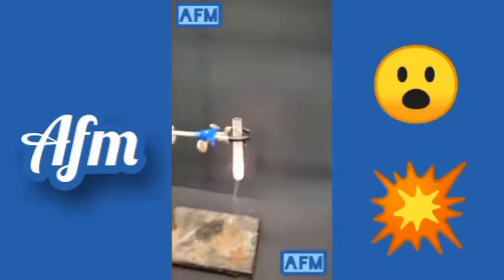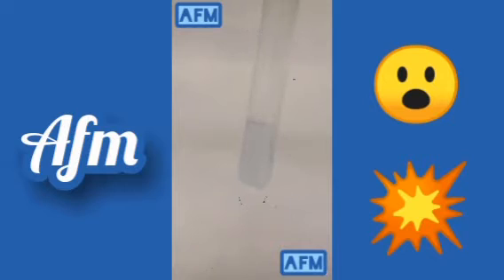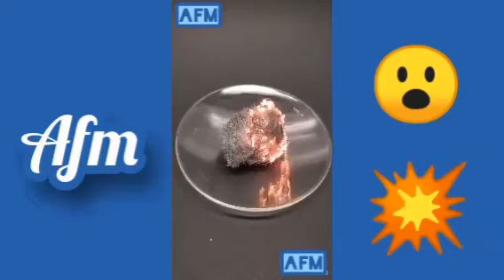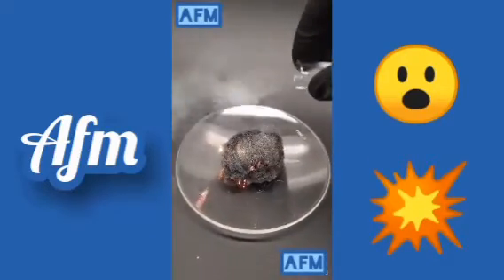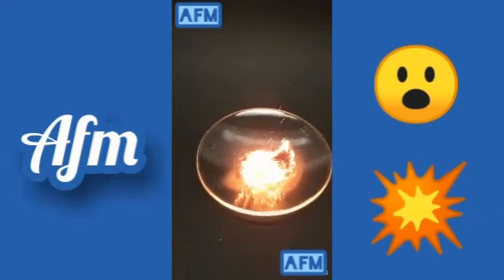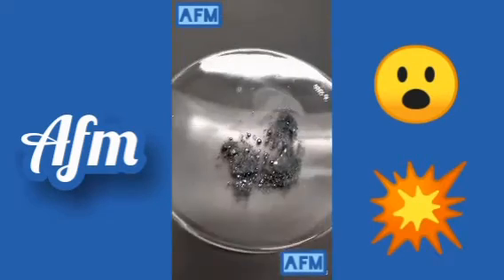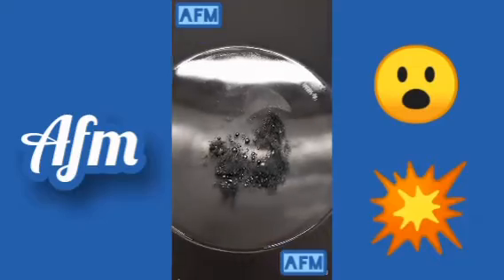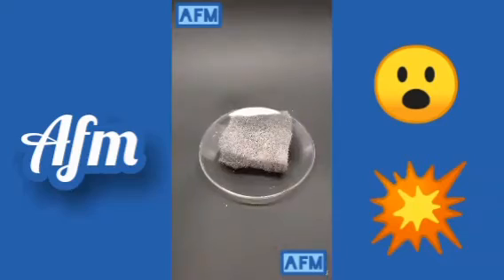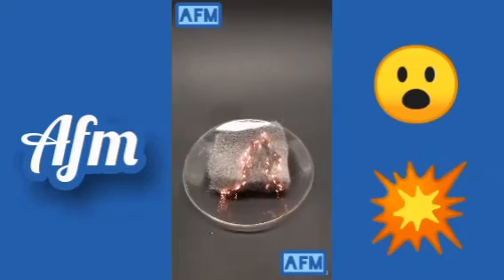Earlier today, I made some liquid oxygen, and I used it to destroy a match, but I still had a bunch of it left over. So I decided to use the rest of it to burn some steel wool. I thought it was all going to disappear, but a lot of it didn't react. The reaction was also apparently hot enough to melt some of the iron. After this, I still had some oxygen left, so I just shot the rest of it onto a larger piece.